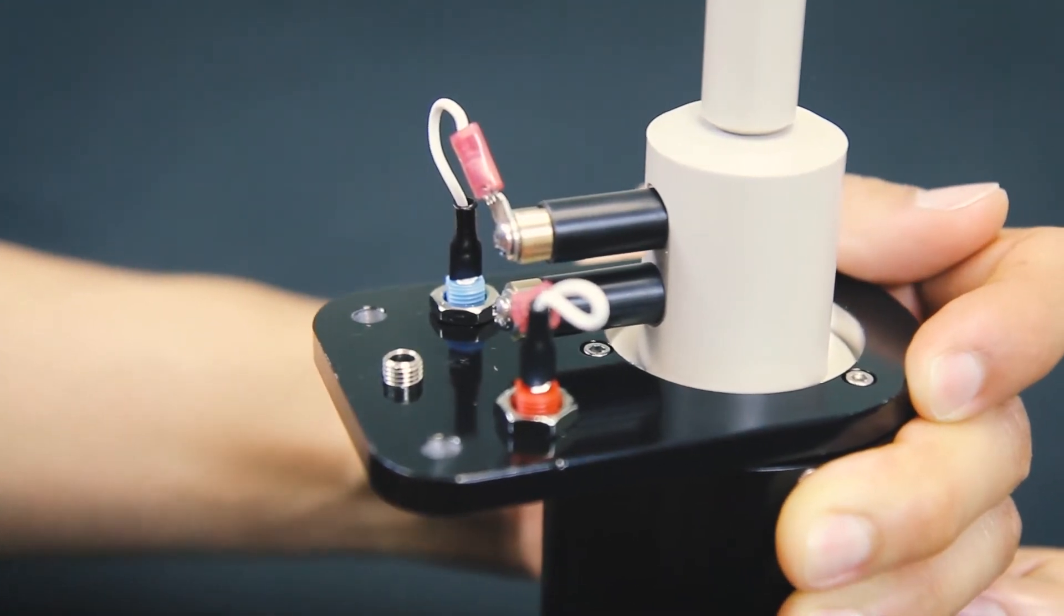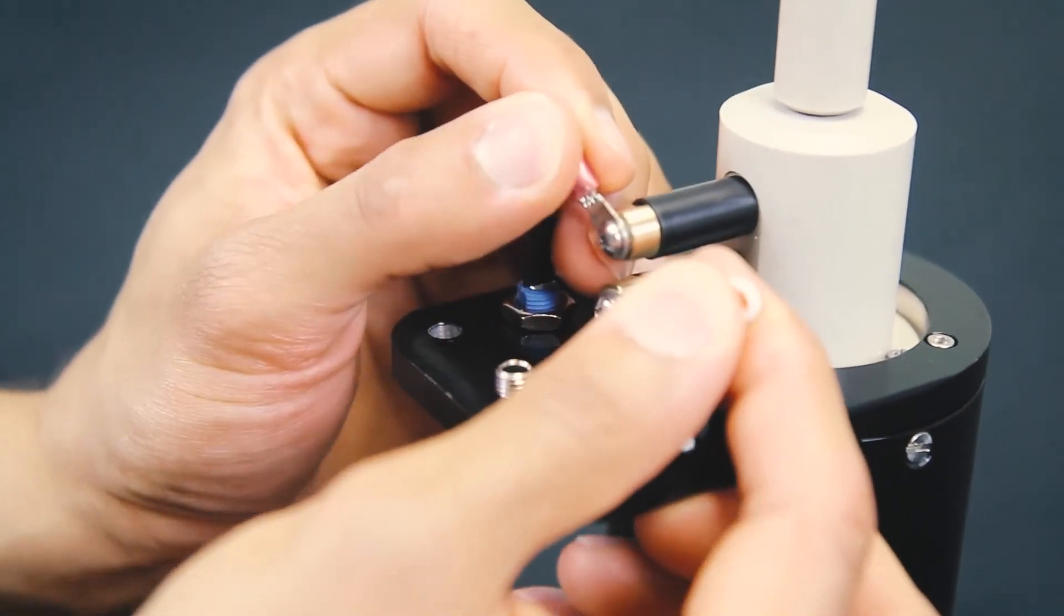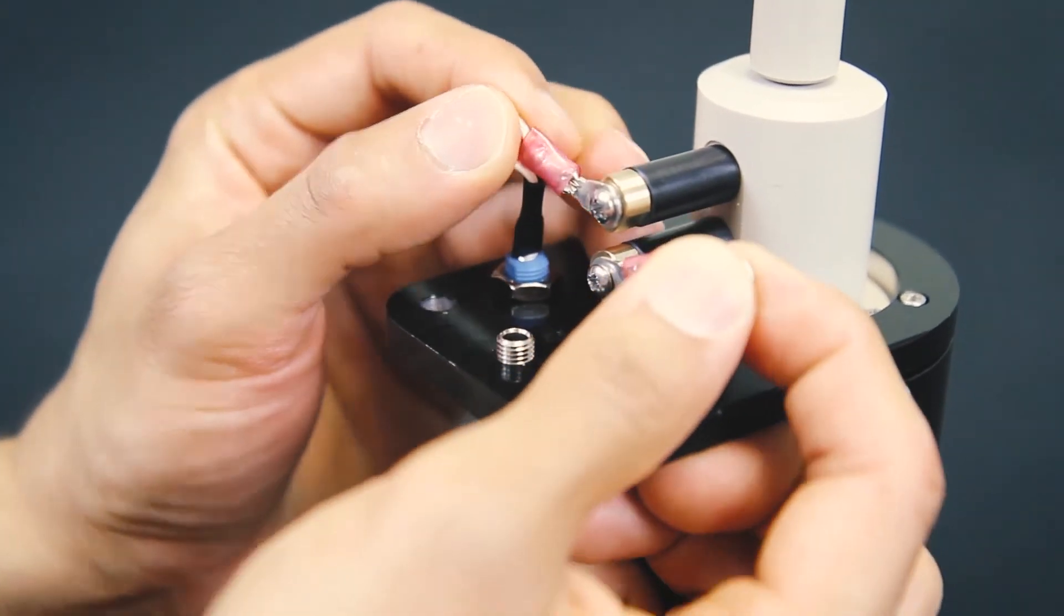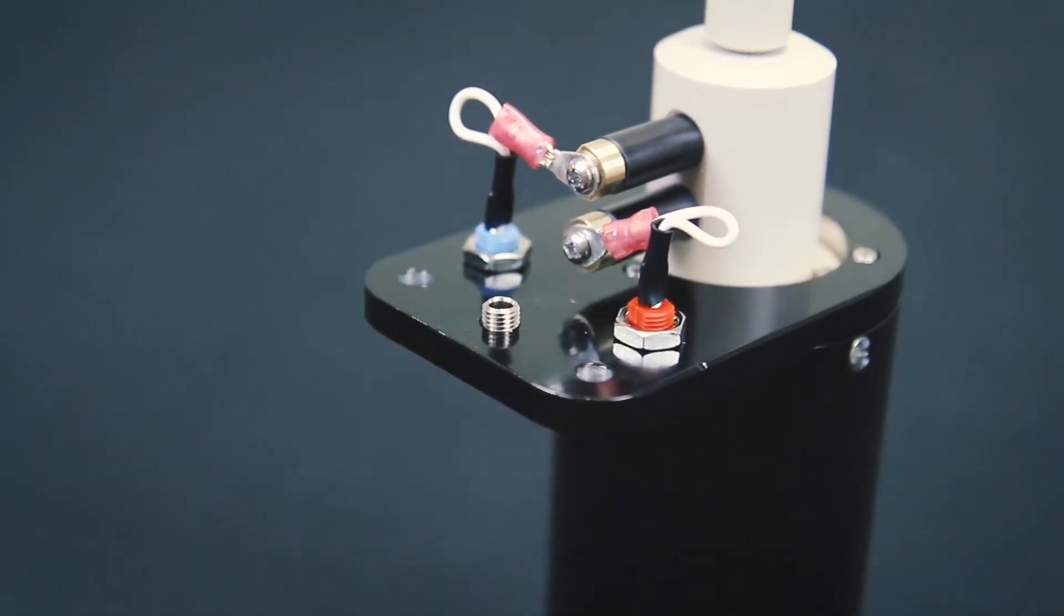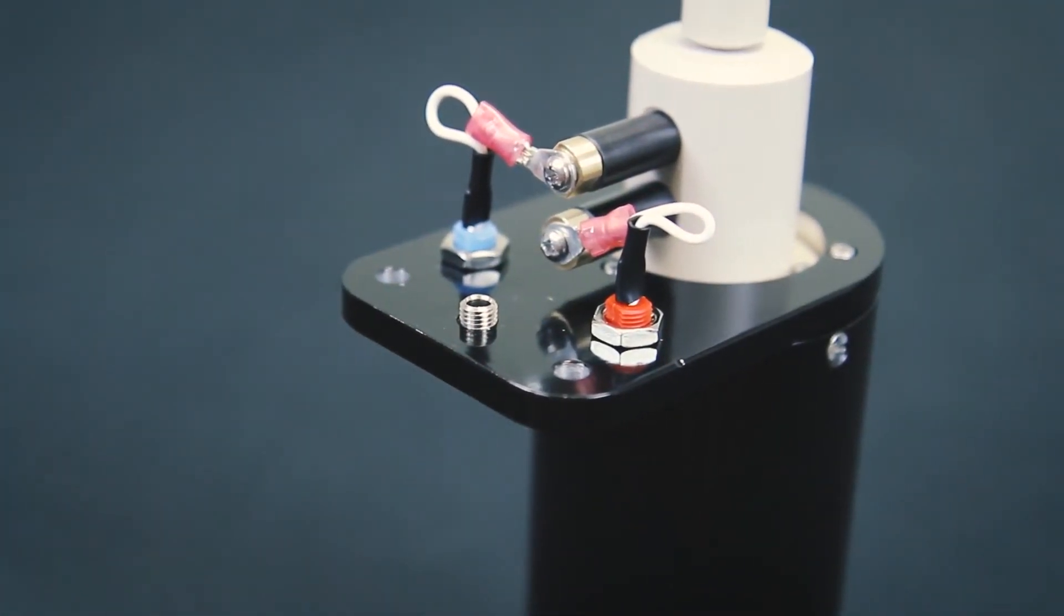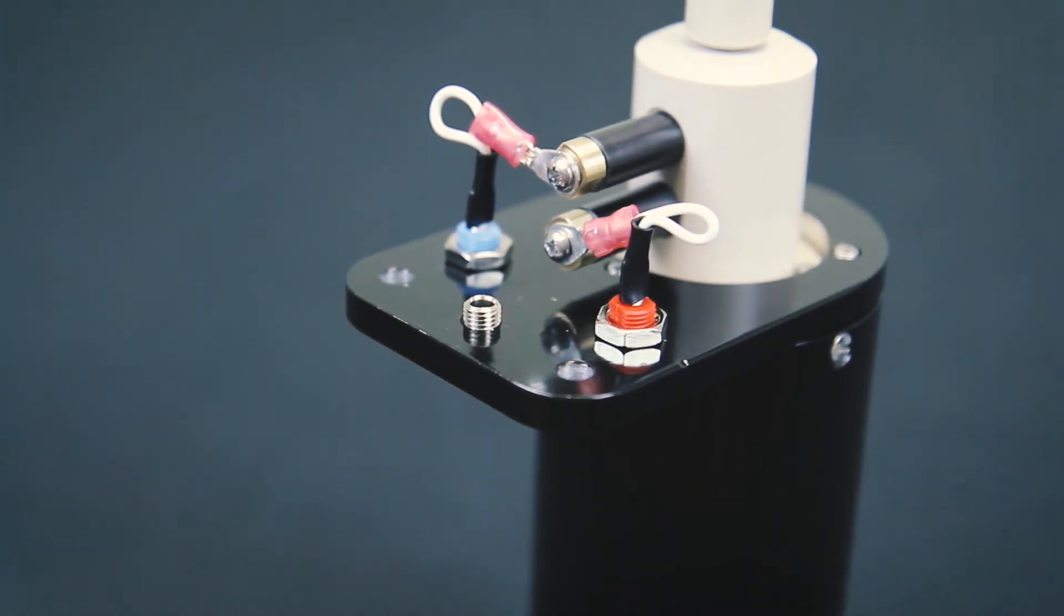Make sure the crimp is in the same orientation as it was at the beginning of this video, where the long side of the ring electrode crimp is perpendicular to the length of the shaft. Otherwise, it won't fit into the lift bracket.